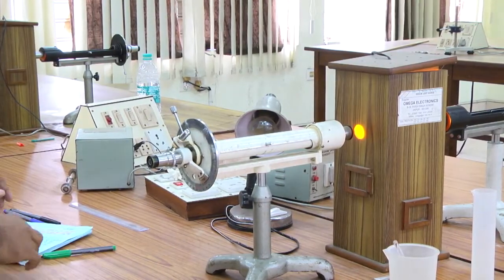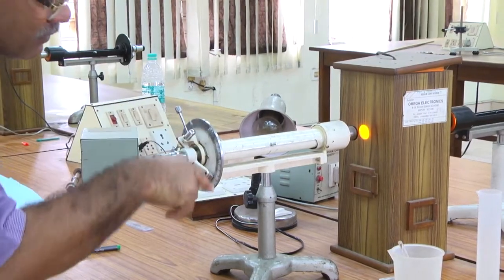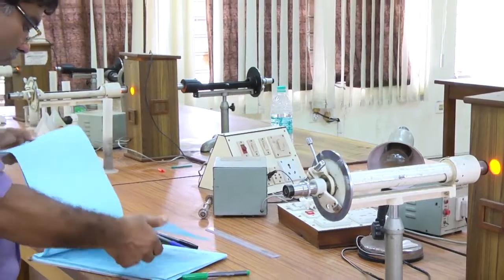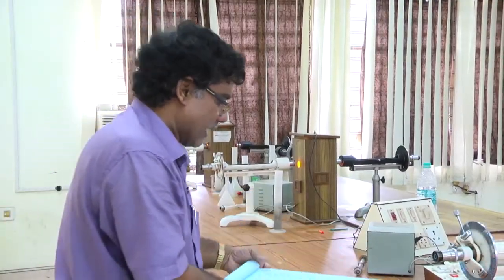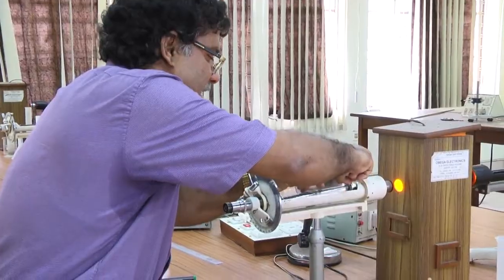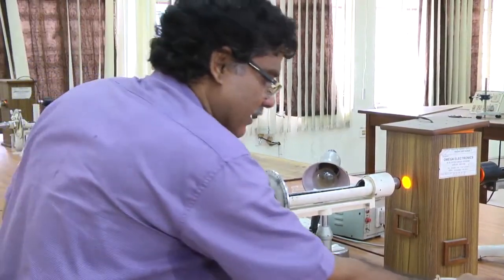Now, this is done as per this one, because noting down the reading is not difficult. So, this tube, just as I showed, put water and then do it, okay. And then if you use the same tube, remove this water and prepare the solution.